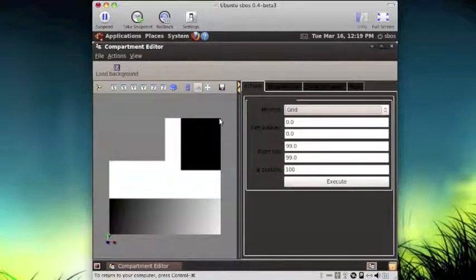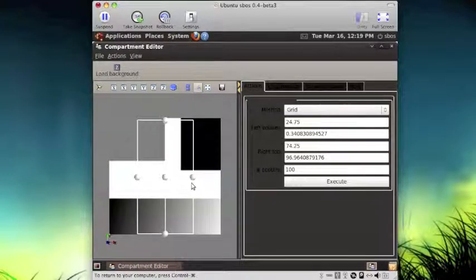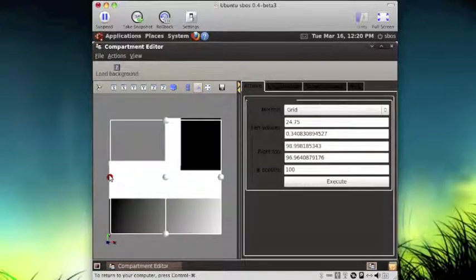If we want to set it manually, we can use a cut plane. So I'm showing the cut plane right now. And now I'm able to tune what kind of values for this object I want to have. So I will set it more or less like this one, like it was before. Now we can turn it off.